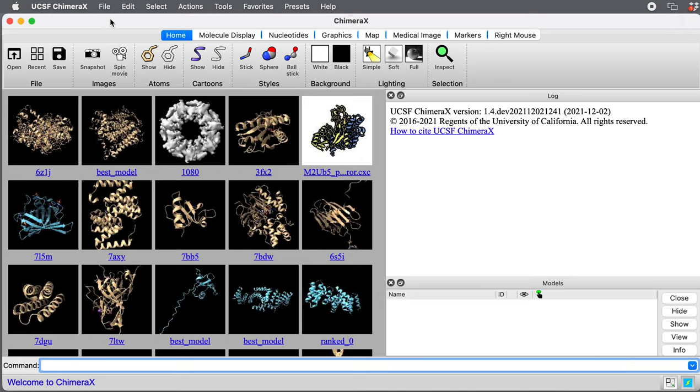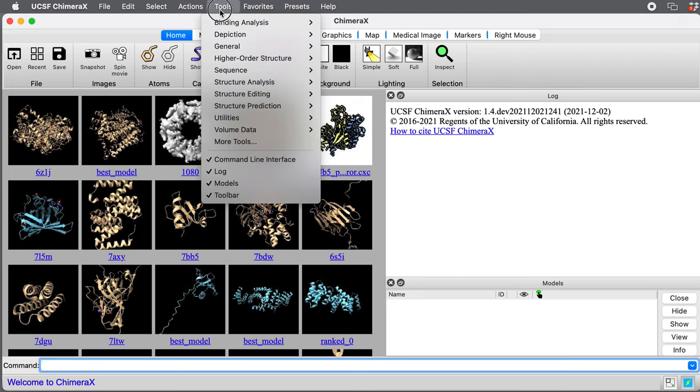I'm using Chimera X, a daily build from December 2nd. You'll need a daily build newer than December 2nd to do these predictions of complexes. It won't be in the Chimera X 1.3 release, but it will be in 1.4 when that comes out.